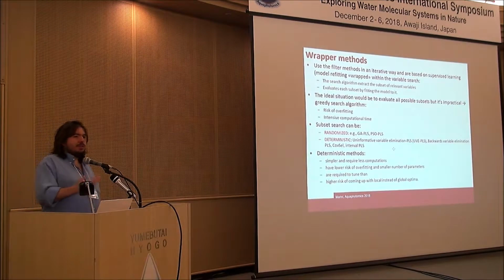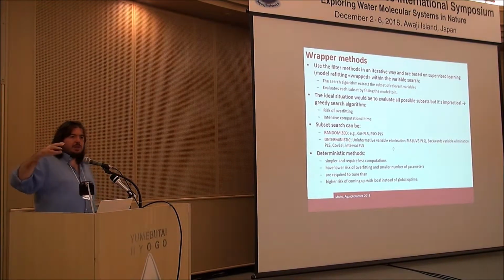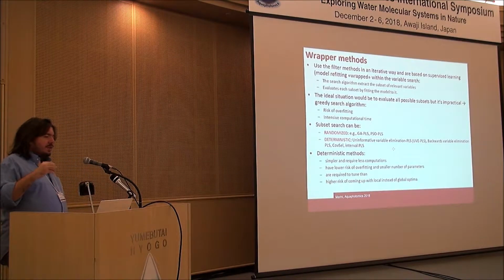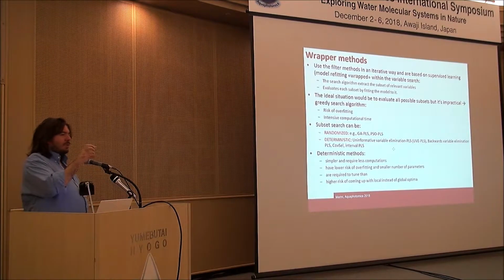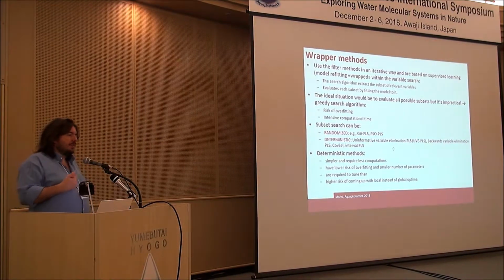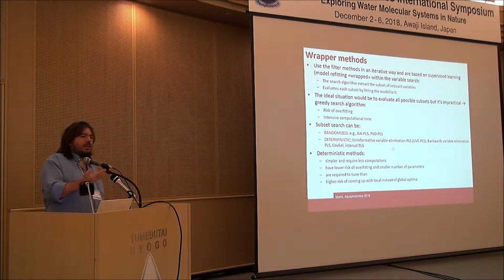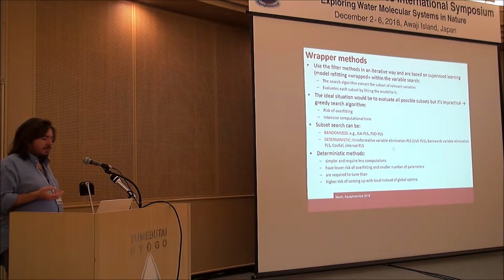It may be in a consensus way, it may be in a winner-takes-all way, but the idea is that you still are considering directly models built on subsets of variables in checking the goodness of the performances of the variable selection method one is performing.